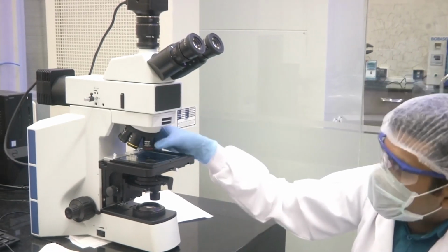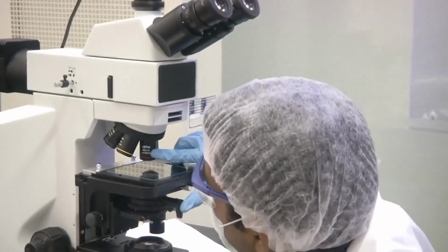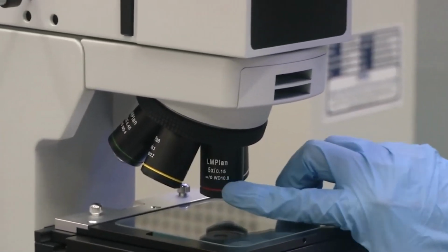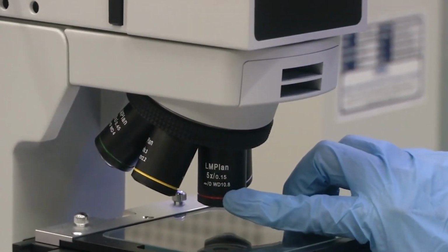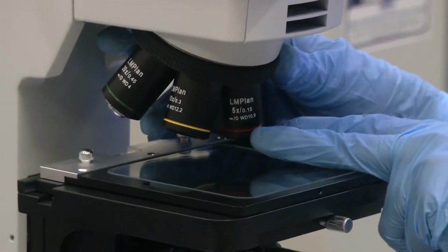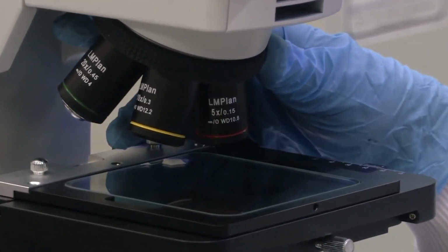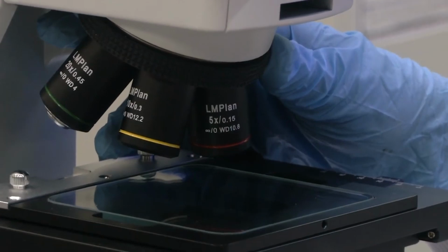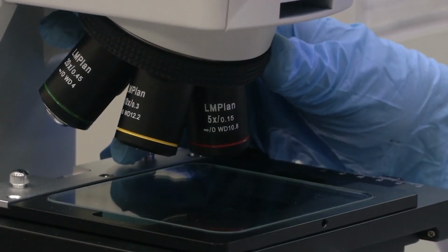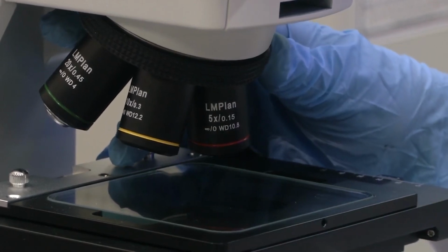This is one lens. If you look at the lens, you can see that it is written LM plan 5x/0.15 and WD 10.8. WD is called working distance. It is a measure of how close to the sample you can get, or how far away from the sample it is useful to use that lens. It means both. And 5x tells you the magnification that this lens can provide.